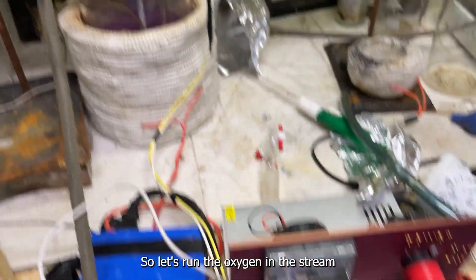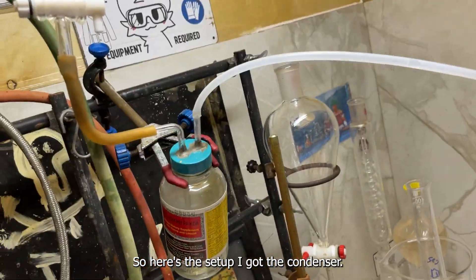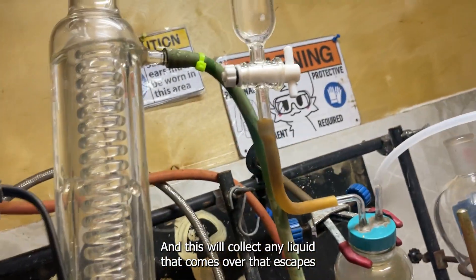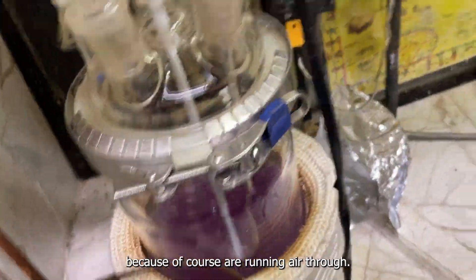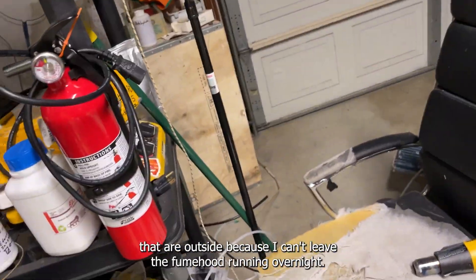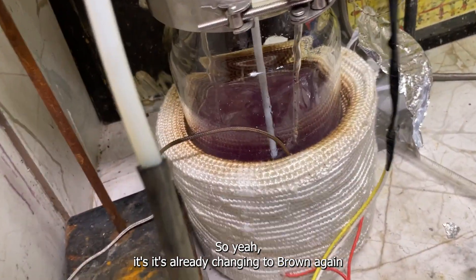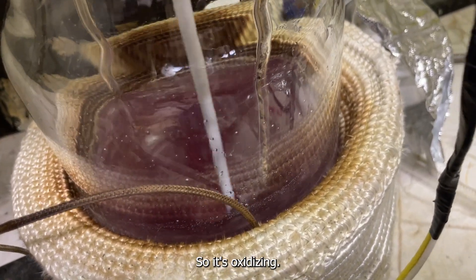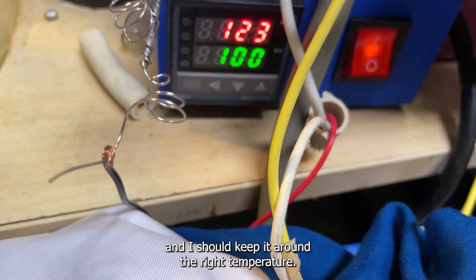Let's run the oxygen and stirring, and it will promptly start changing colors again. Here's the setup, I got the condenser, you can see acetone and there's already boiling. This will collect any liquid that comes over that escapes, because of course we're running air through so some of the vapor gets carried over. The tube just vents it outside because I can't leave the fume hood running overnight, I'm not allowed to. It's already changing to brown again once we start the oxygen. It's at 70 celsius so I've decreased this a bit more, and I should keep it around the right temperature.